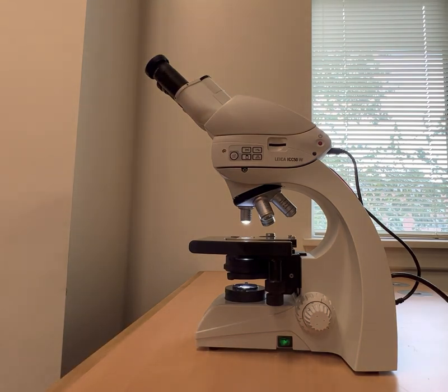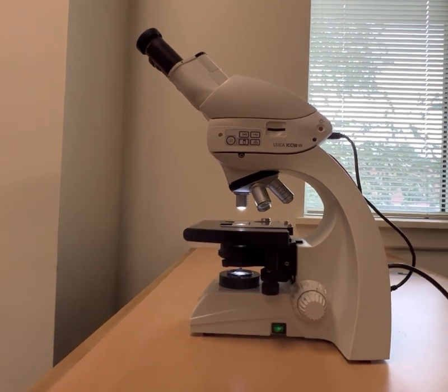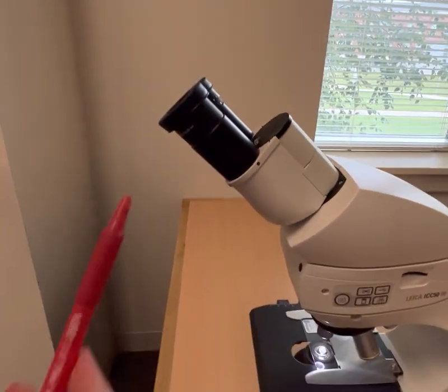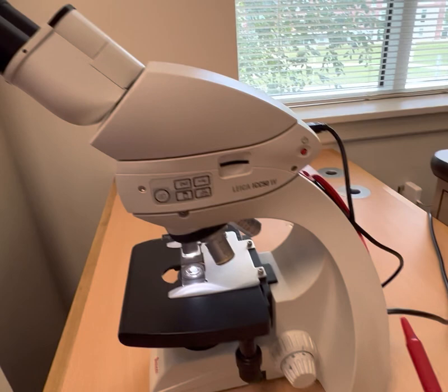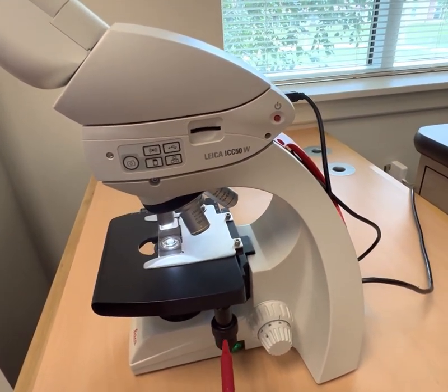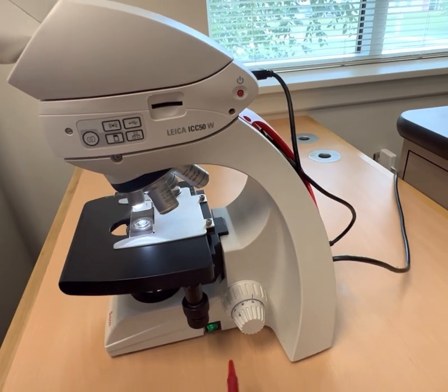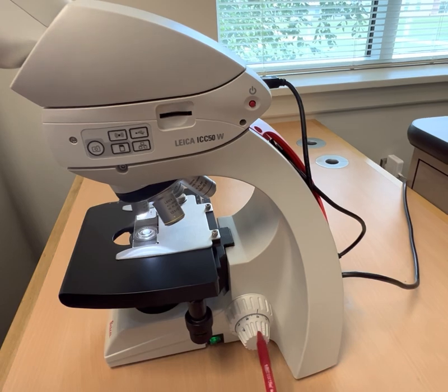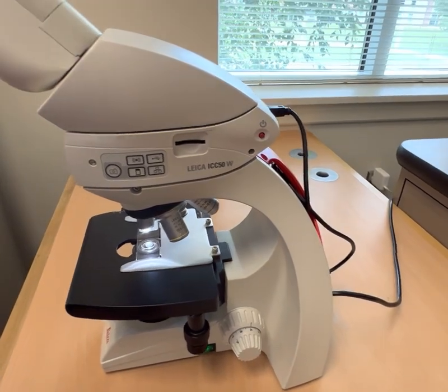I want to show you the other parts when you're looking at stuff on the microscope. So we talked about these guys. We had the oculars, our tube, the arm, the mechanical stage, the stage knobs here that move it up and down and left and right. That's our power switch, and that was going to be our coarse focus knob, the big one, and our fine focus knob is the small one.